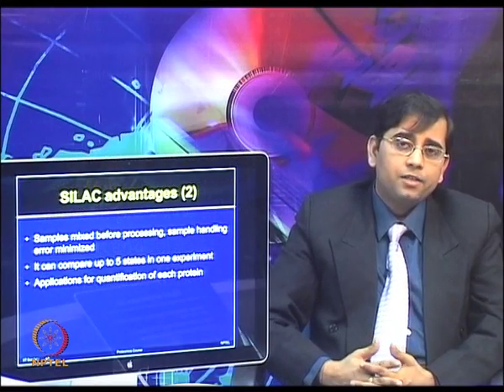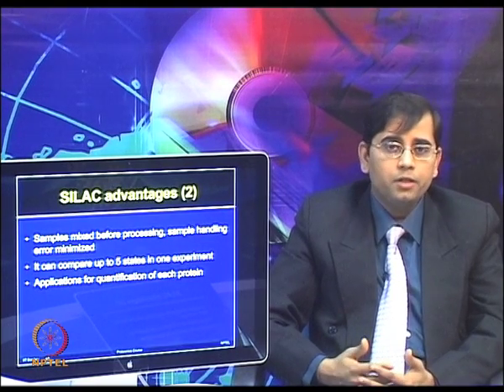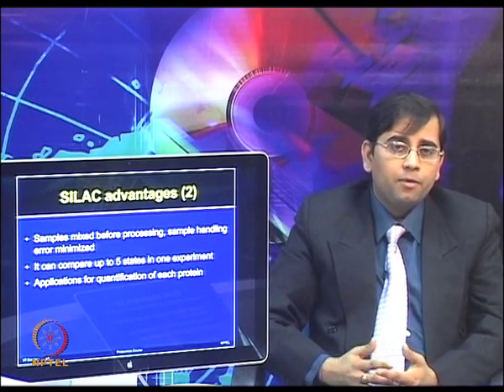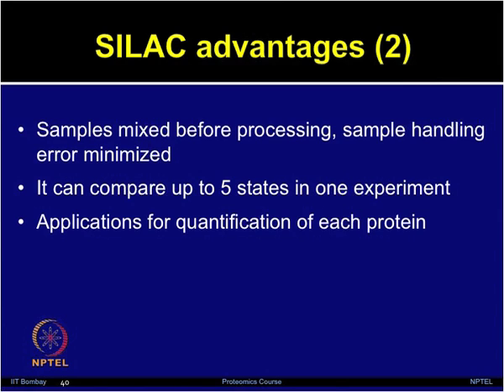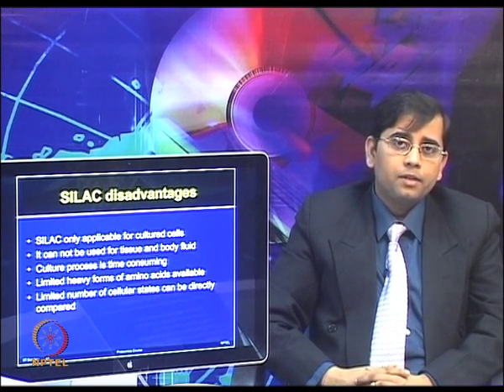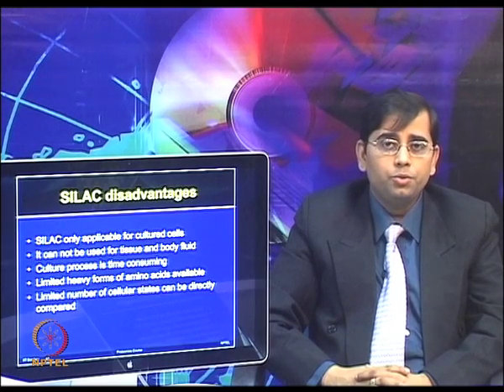So, samples can be mixed prior to the processing before doing the mass spec analysis. So, this method eliminates some of the handling errors. Now, SILAC experiments have demonstrated that it can provide the 5-plexing capability to compare 5 different states in one experiment. So, there are various applications of quantification of proteins by using the SILAC method, which we will discuss in the next few slides.